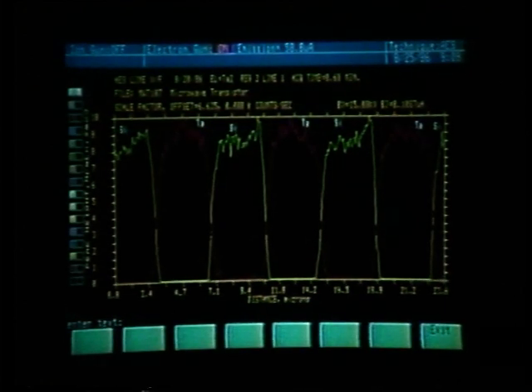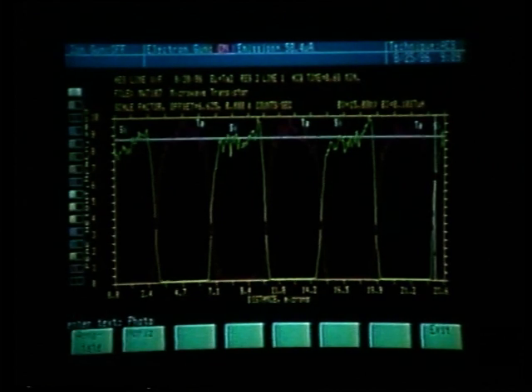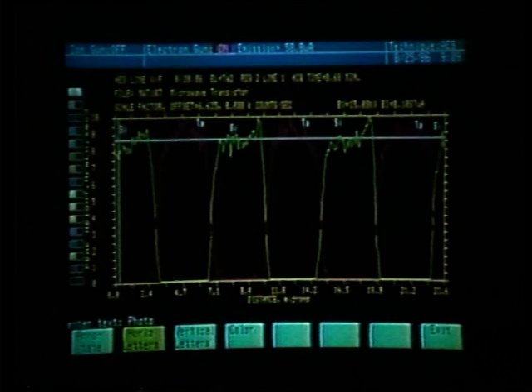I would also like to refer this line scan to the SEM photo where we have the line scans, which was photo 106. We'll start out with photo, and let's put that in an open area under the silicon line scan here.